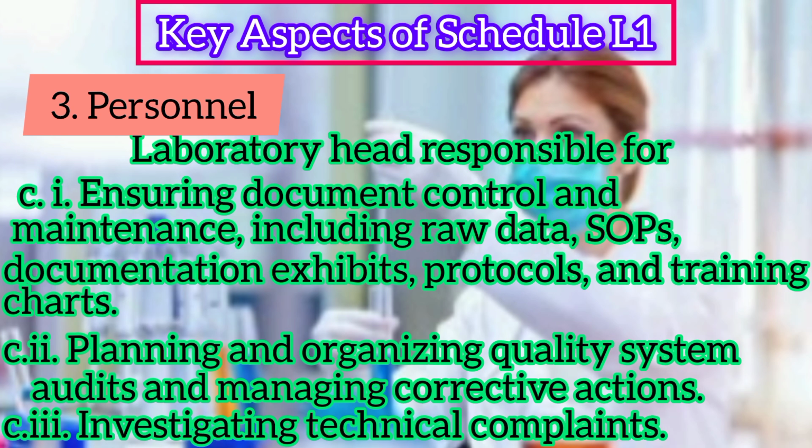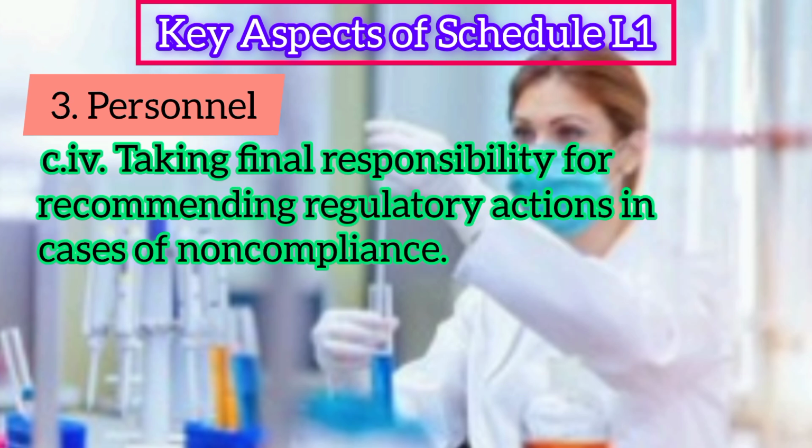Laboratory head responsible for C.1. Ensuring document control and maintenance, including raw data, SOPs, documentation exhibits, protocols, and training charts. C.2. Planning and organizing quality system audits and managing corrective actions. C.3. Investigating technical complaints. C.4. Taking final responsibility for recommending regulatory actions in cases of non-compliance.